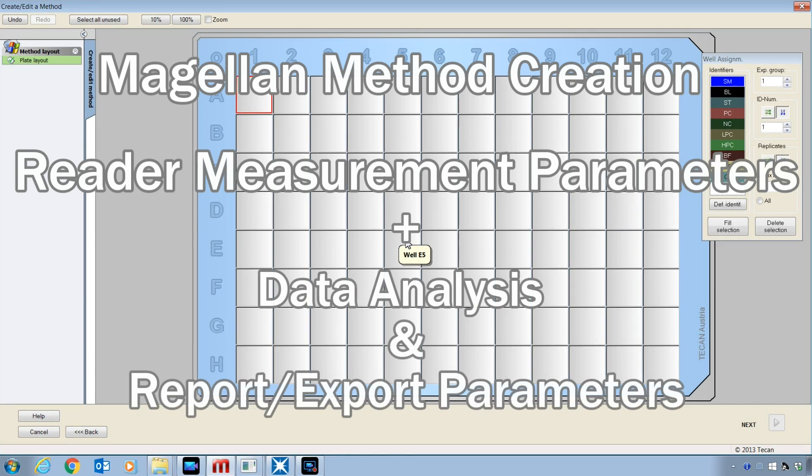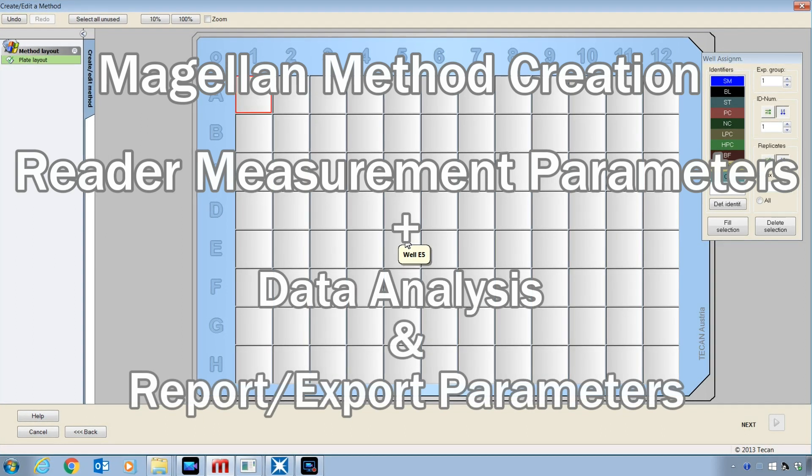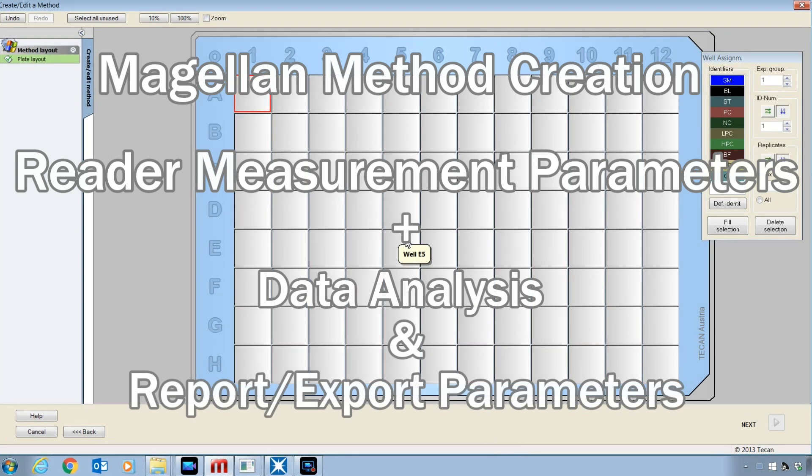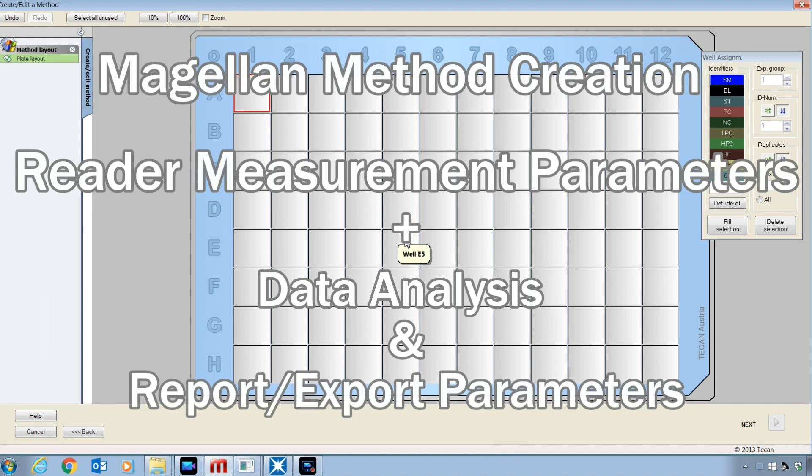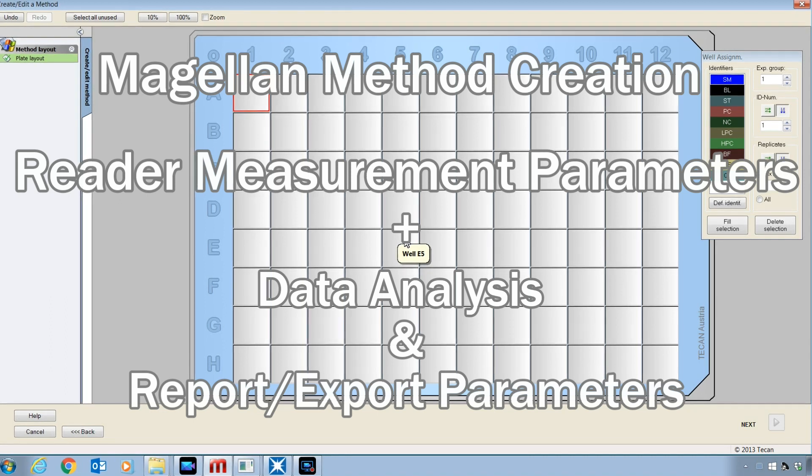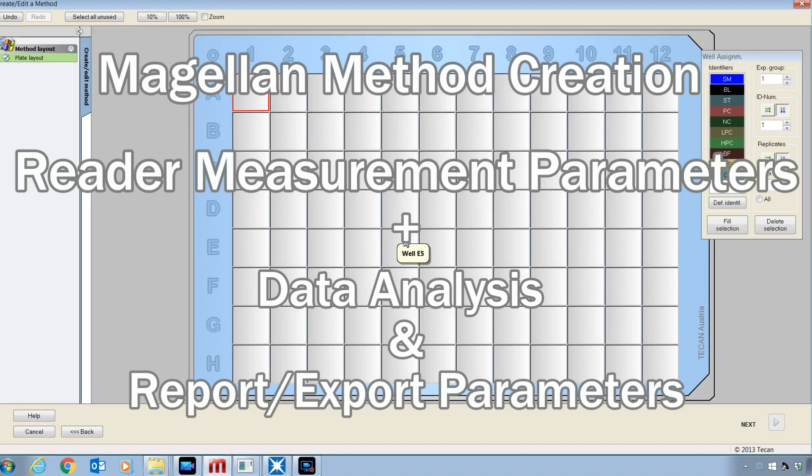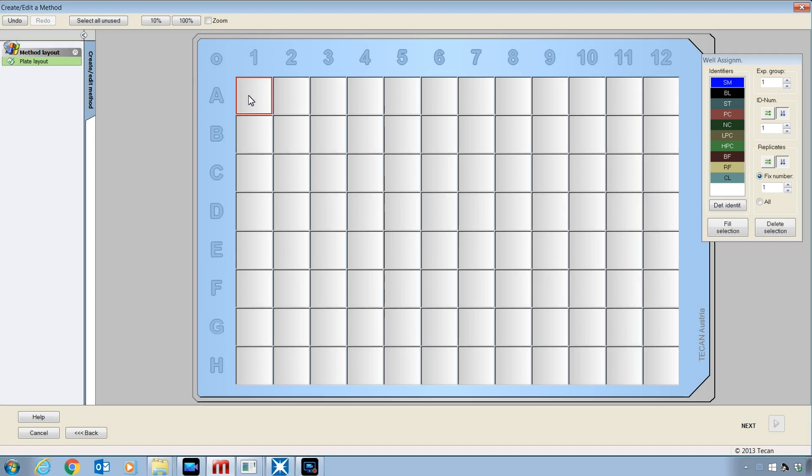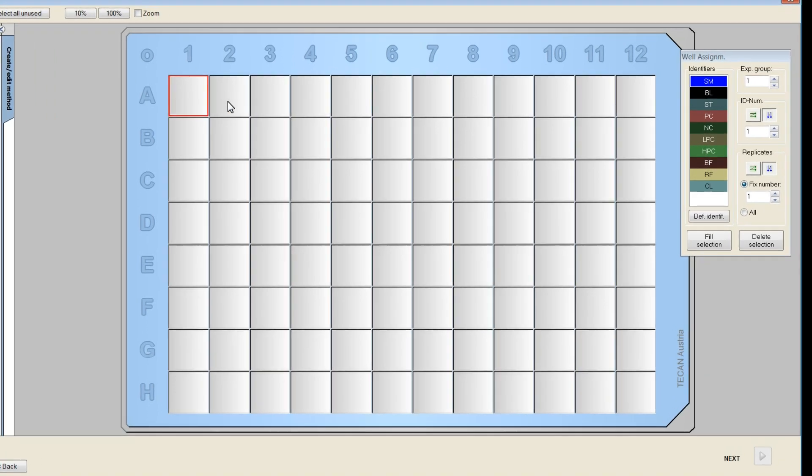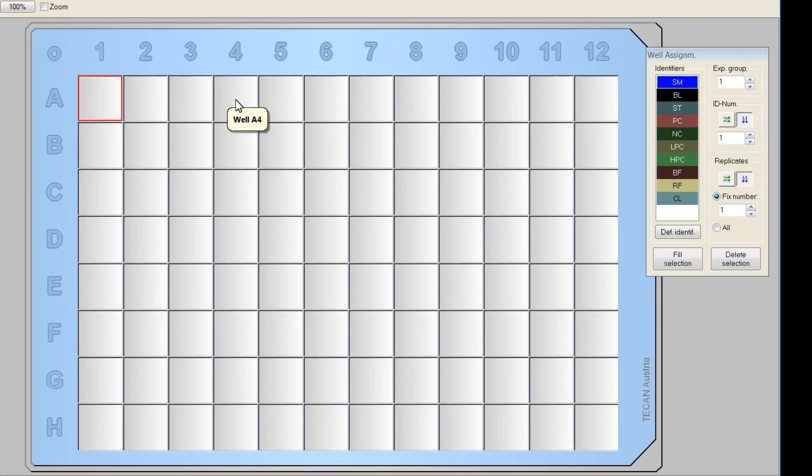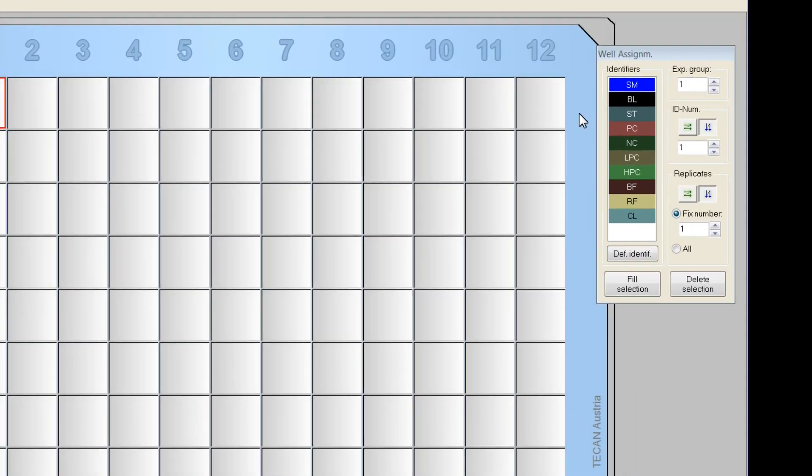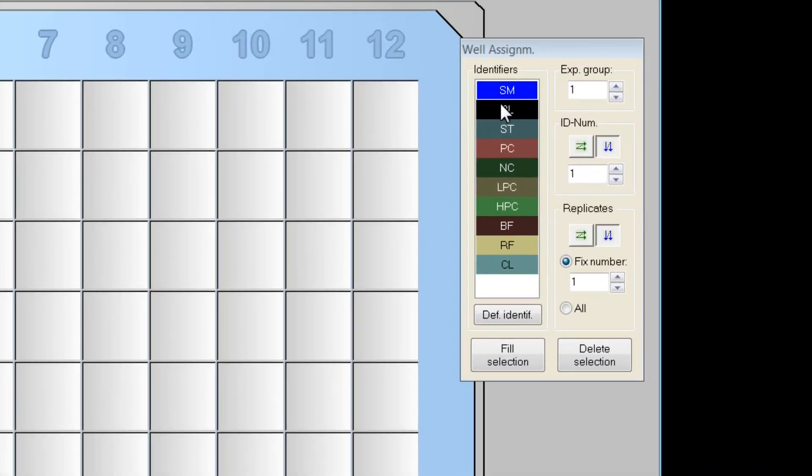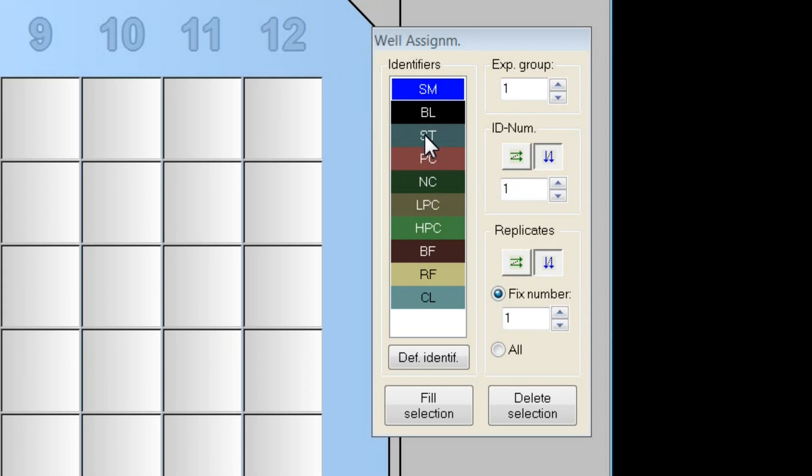We are now entering part two of the method creation process. This is where we will develop the data analysis and reporting part of our method. The first step is to design a plate layout using identifiers to describe the nature of the samples in each well. Magellan provides some default identifiers already, and you may create new ones if necessary. For now, I will keep things simple and use the defaults.